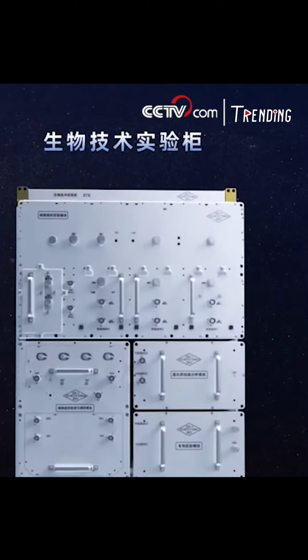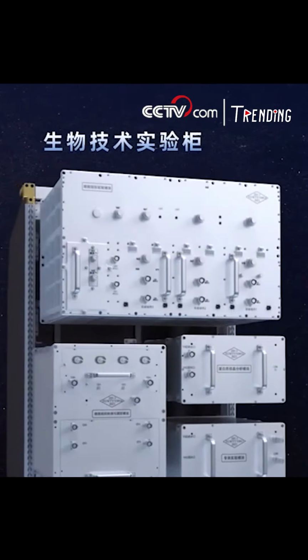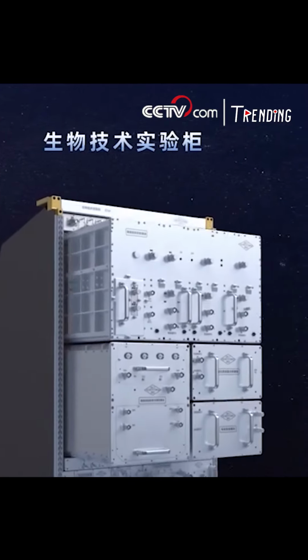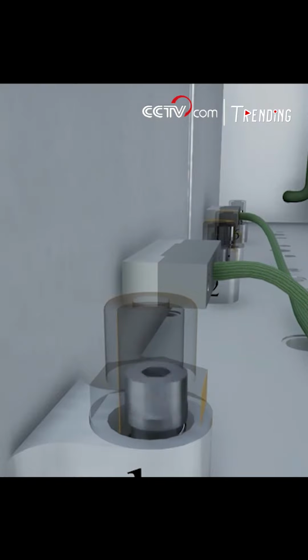The biotechnology cabinet focuses on cell experiments. It involves cells of bones as well as muscles. It's also for the future treatment of diseases in space, including bone loss and organ transplant like the heart, plus more basic research. They are basically done automatically, and taikonauts would also look after them, for example, replacing them based on the progress of the orbital experiments or making adjustments.